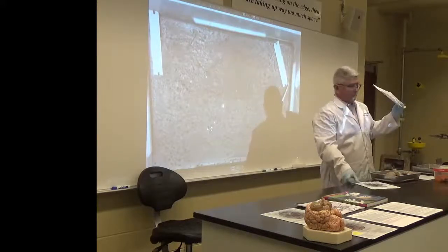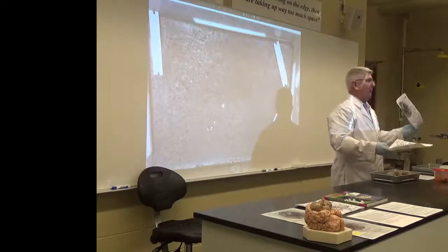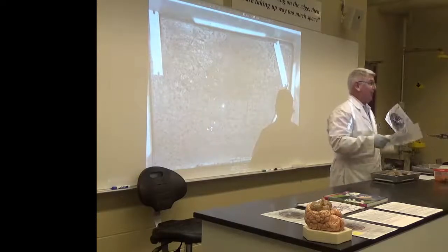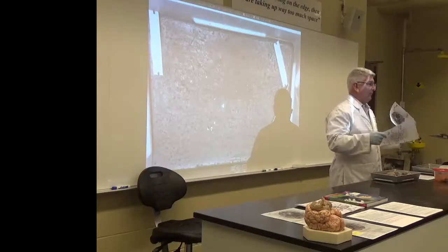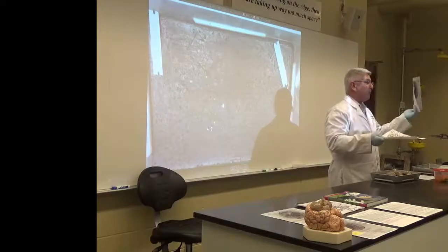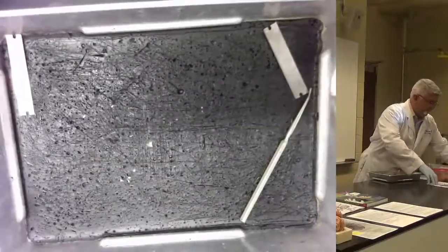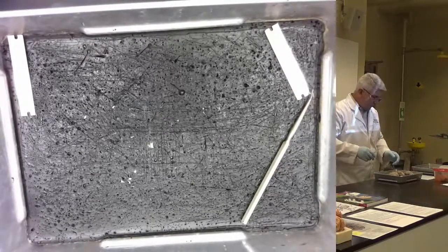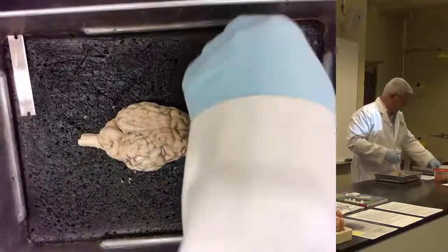and you're looking down in the brain. So all of these structures that we're talking about today are what we call subcortical structures. They're not on the cortex, they're not on the midline, they're deep inside the brain, and so surrounded by tissue. So the only way to see them is through horizontal coronal cuts. So we'll have these two, and I'll go over those as well. I'm going to do a couple more. I'll probably do two cuts here, so I'll kind of run through everything twice.